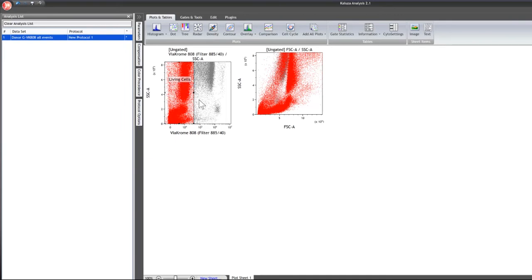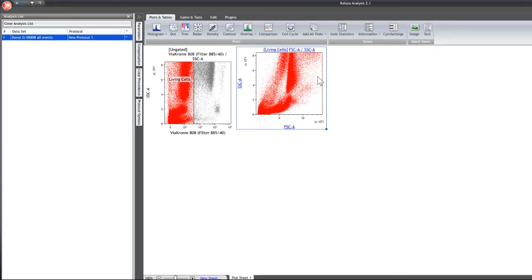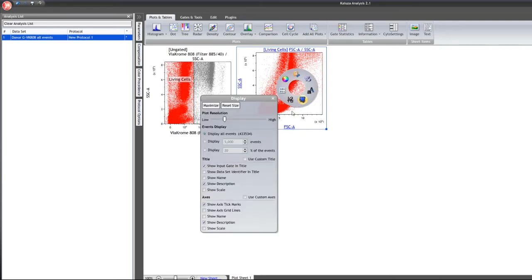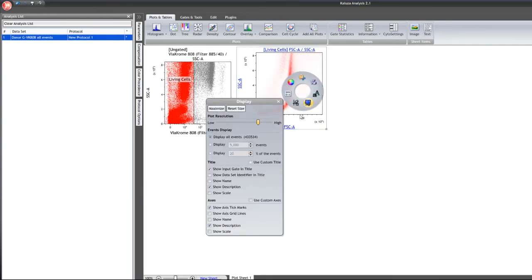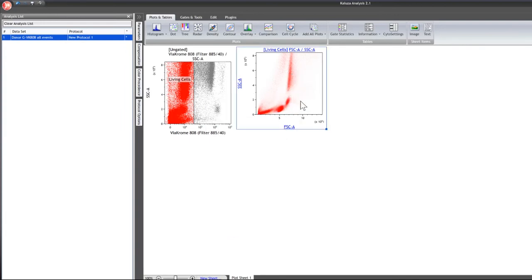To focus only on living cells, click where it says 'ungated' and select the living cells gate. If we want to focus on the lymphocytes — the population in the lower region — it can be difficult to distinguish them from the lower end and from the monocytes. The way to easily identify populations is by adjusting resolution. Right-click on the plot, select the display option, and use the plot resolution slider bar. Increasing the plot resolution makes it much easier to see the definition between these populations.